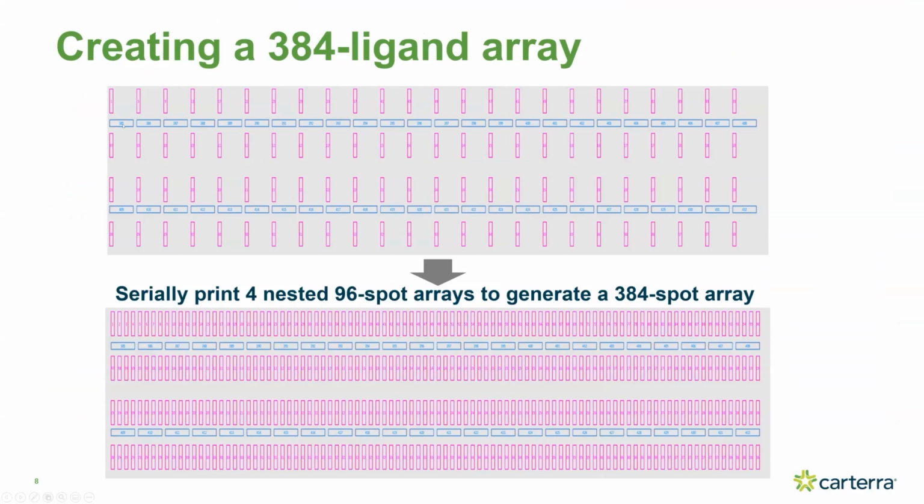In either image, you can see that there's a horizontal blue rectangle, and that is actually showing the interspot references. So these are unprinted spots that are used to subtract things like refractive index changes from the data stream. And so those are all collected in real time. And in the bottom, you can see there's 4 ROIs or spots above and below each reference. And so there's 8 active spots, and the reference is subtracted from each of those 8 automatically. So there's 48 total reference spots.